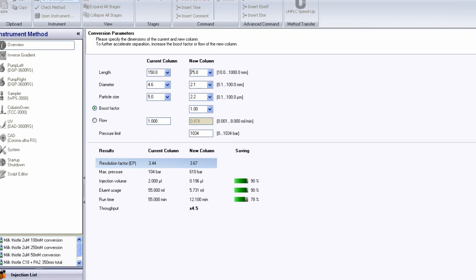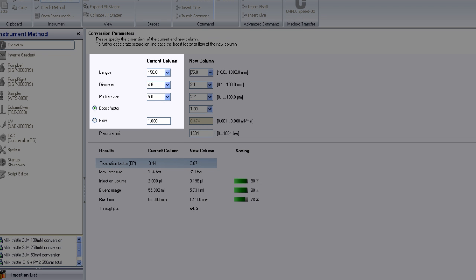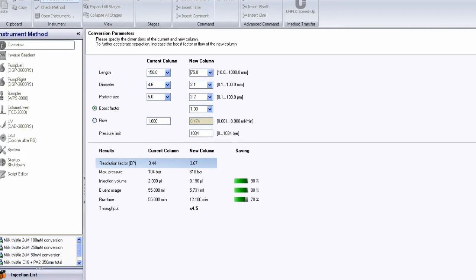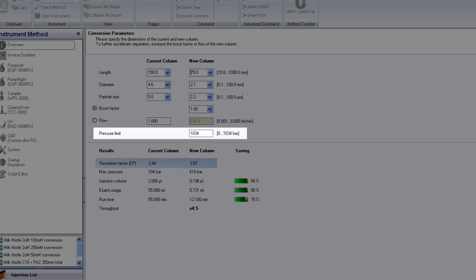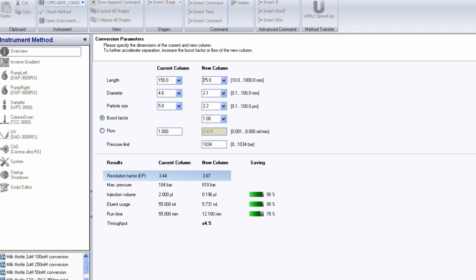We can then put in our current column configuration and use the tool to plan for different types of small particle columns and different lengths, to find the best column to purchase or already in our drawer. I'm putting in the current column length of 150 mm with a 4.6 mm column and a 5 micron particle size. I can then assign the backpressure rating of the system I'm using, and that information is used by Chromeleon to make sure we can run the selected small particle column on our current system. I can also choose column length and particle size.